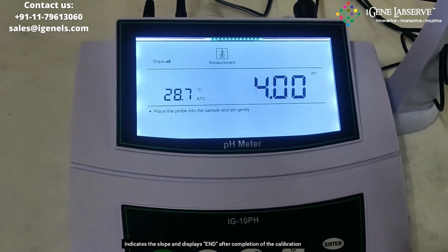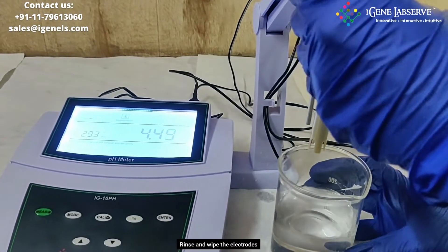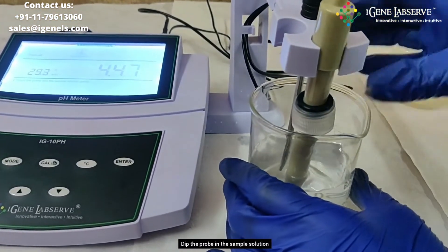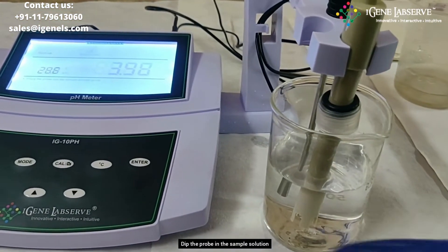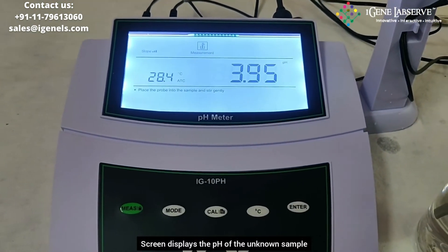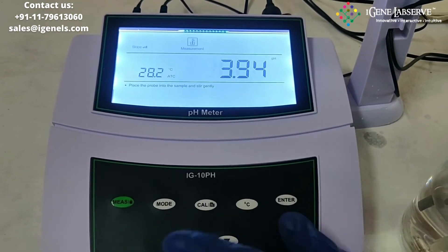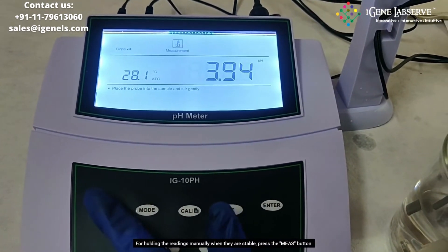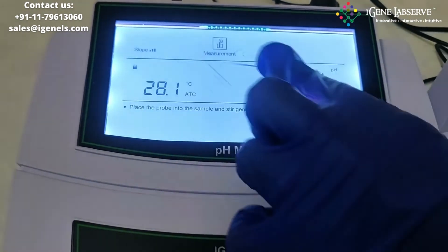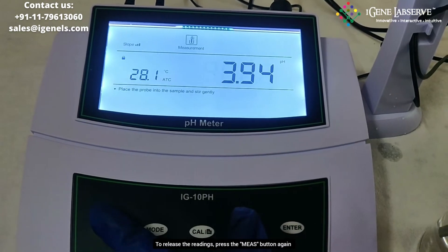After calibration, rinse and wipe the electrodes, then place them in the unknown sample to measure its pH. The display will show the pH of the unknown sample. If you want to hold the reading, press the measure button and the reading freezes. To release the reading, press the measure button again.